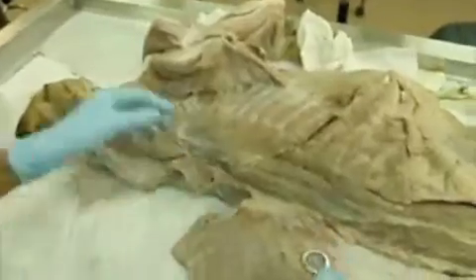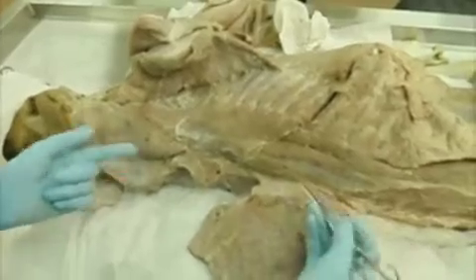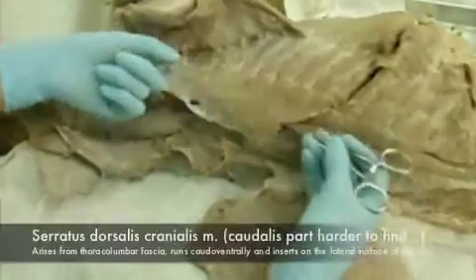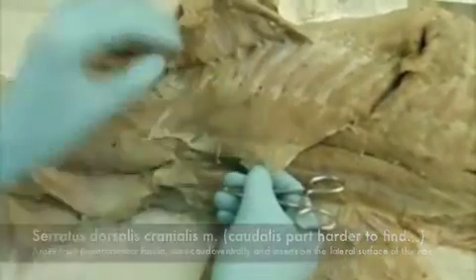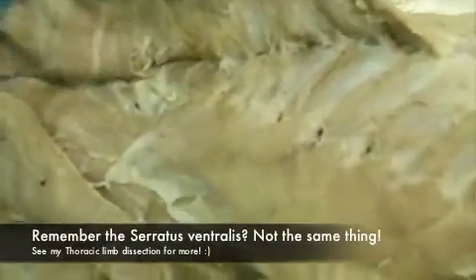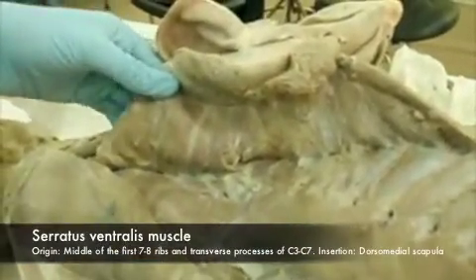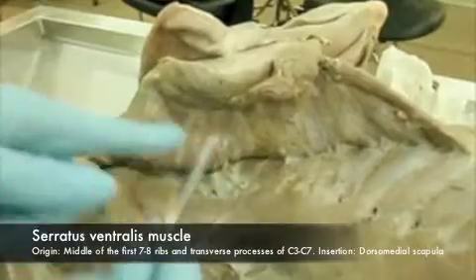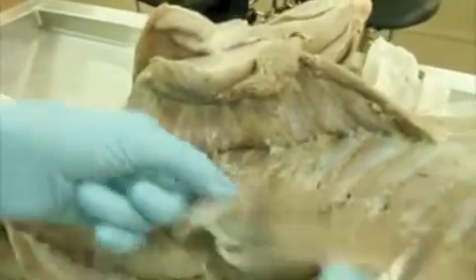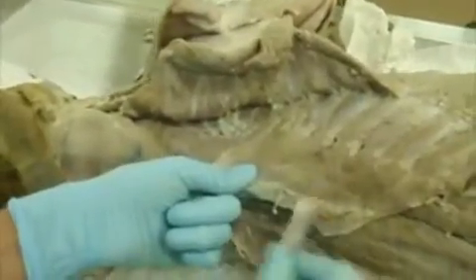To start, we know there's 3 systems to the back, the muscles of the back. I'm just going to quickly mention a few other random muscles that we have here. Example here, we have the serratus dorsalis cranialis. If you look at my tutorial about muscles of the forelimb, remember there's the serratus ventralis here. This is the sling muscle that supports the thorax between the 2 limbs. So it's fan shaped. Just to make the difference, serratus ventralis, serratus dorsalis cranialis, because this is more dorsal than this one. So this is the dorsalis and this is the ventralis.